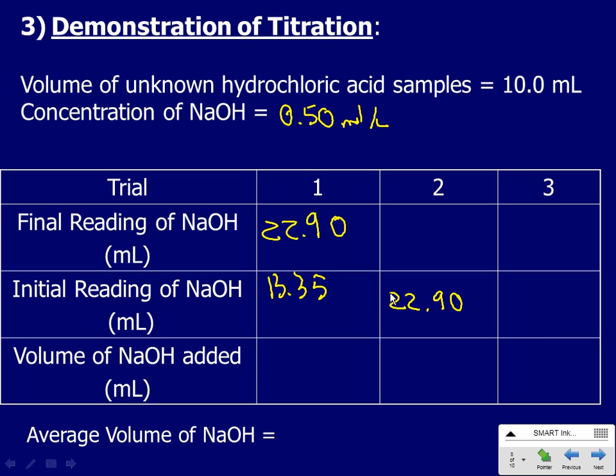So again, run it, swirl, swirl, swirl. I'm keeping an eye on the bottom there. I'm observing the purple as it persists, and it's persisting pretty good. So now I go drop by drop, and again I watch to see as it persists. It's disappearing quite quickly still, so we're doing okay. And at some point, it's going to hang around for quite a long time. There, we're getting close. Whoa, I'm living on the edge. So it still disappeared.